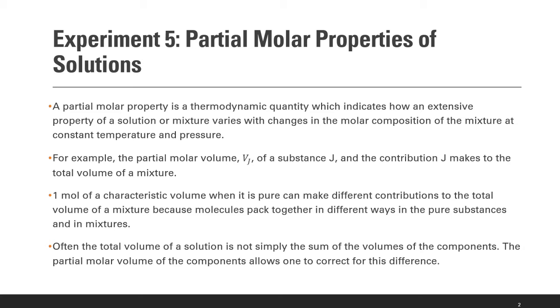So the gist of this experiment is that often the total volume of a solution is not simply the sum of the volumes of the components. So the partial molar volume of the components will allow one to correct for this difference.